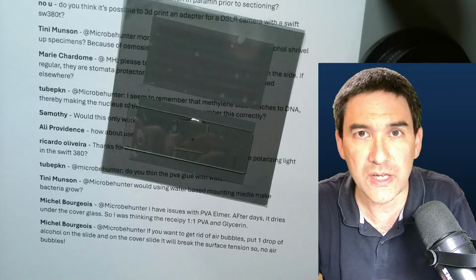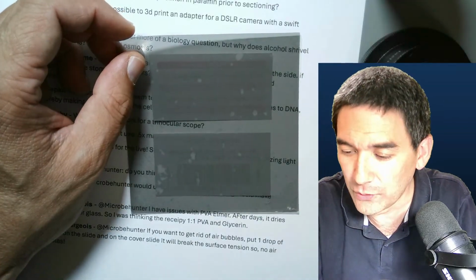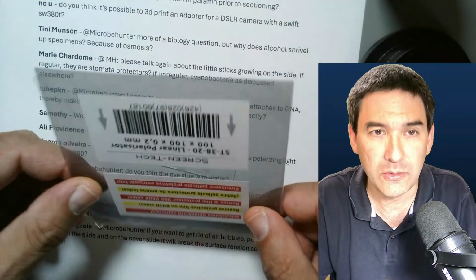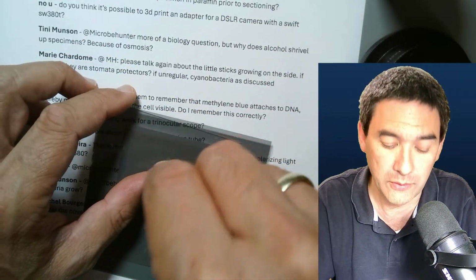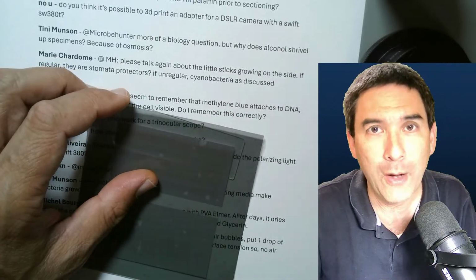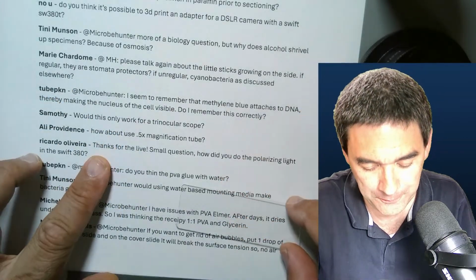And if you use a small magnification only, then there is enough space. So basically, I'll use a different slide, one where there's no mounting medium on it. You take it without the protective film, you put one filter on top here, and then you have the microscope objective directly over here. With low power magnification, it's not a problem. With a high power, you might actually be touching the foil, and you don't want that.